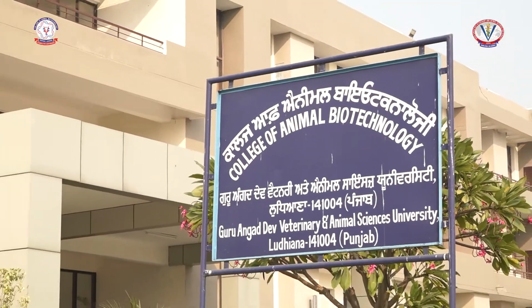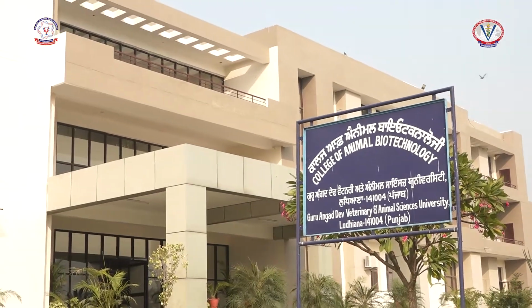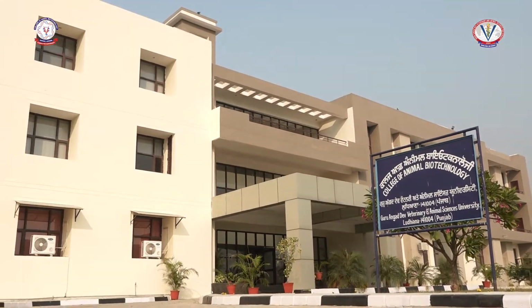College of Animal Biotechnology, Guru Angad Dev Veterinary and Animal Sciences University Ludhiana has taken an initiative to prepare technique-based educative videos to cater to the demands of undergraduate, postgraduate and doctorate students. These videos will help the students to understand concepts, principles and steps of various molecular techniques in a better way. Further, the videos are aimed to make the students self-sufficient and give them a feeling of hands-on training while they are away from the labs.